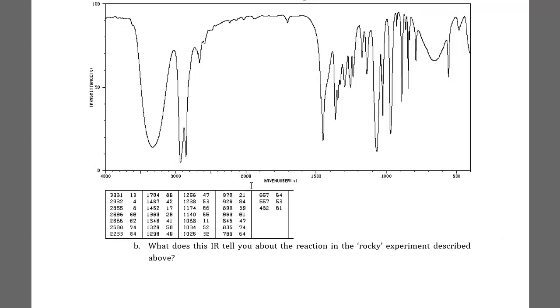Finally, let's do a brief discussion about IR analysis. Looking at this and based on what we know about this experiment, what I see here is an alcohol functional group. This broad stretch from about 3000 to 3600 is our broad stretch, which is our alcohol functional group with hydrogen bonding potential, which broadens that stretch. For a lot of organic compounds, we expect to see some sp3 hybridized CH stretching just below the 3000 mark. Looking at our compounds, this looks like it would have OH stretching. The hydrogen-oxygen bond of an alcohol functional group is expected to be around 3100 to 3600. When writing this down, it's best to represent this as a stretch within that range. Instead of saying 3331, these broad stretches should be given a range - 3100 to 3600 for that number.